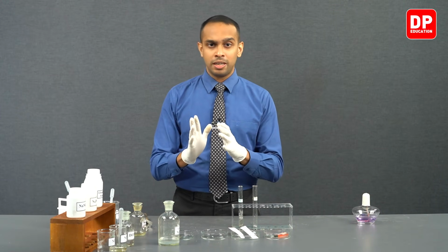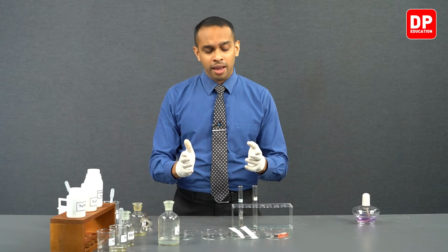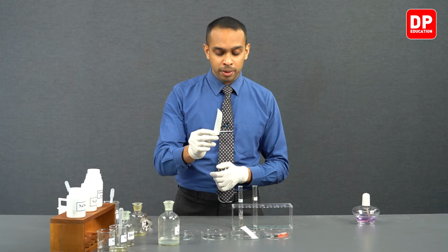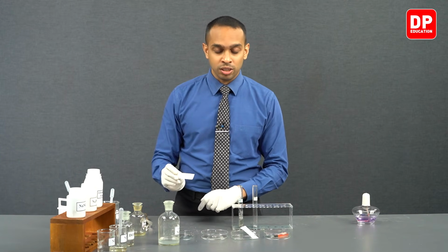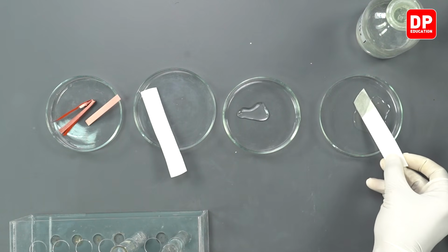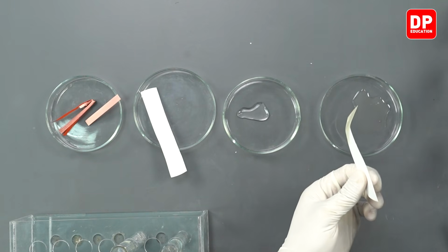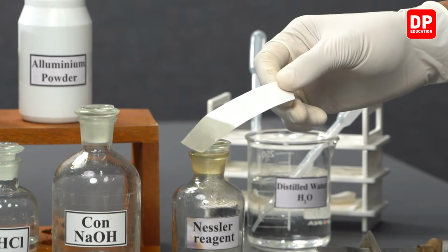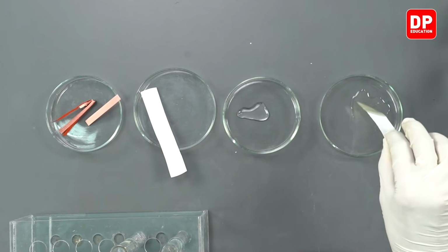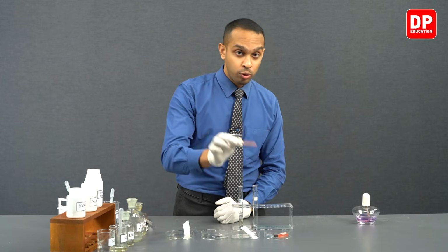So as soon as we add sodium hydroxide, ammonia gas will be produced, and we are going to use a piece of filter paper dipped in Nessler's reagent. So we have on a petri dish here a little bit of Nessler's reagent. So we are going to soak this filter paper with Nessler's reagent. As you can see here, you can observe the color. We have this filter paper soaked in Nessler's reagent here in this petri dish.